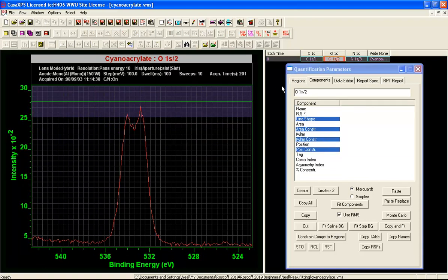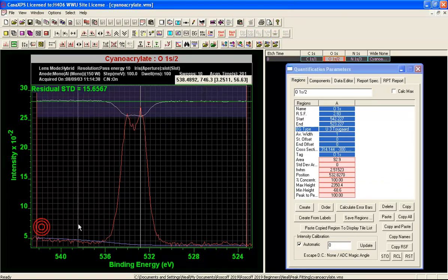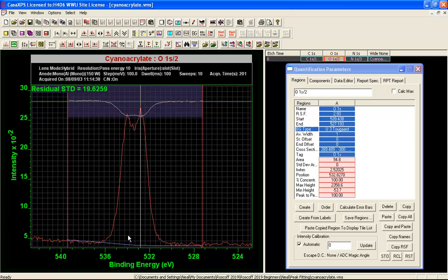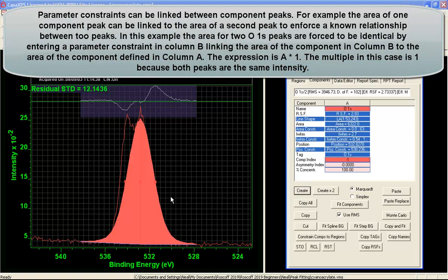the opportunity to start from the beginning and go through and create a background which then approximates the signal that corresponds to scattered electrons, inelastically scattered electrons, that result in a loss of energy from photoemission peaks with higher energy. So this is not the signal that is relating to the amount of oxygen, it's only the signal above this background that we're interested in calculating for quantification by XPS. And once we've got a background set up, we can then apply a pair of peaks.